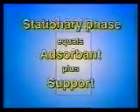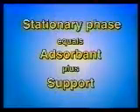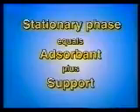In this type of partitioning chromatography, a thin layer of adsorbent is coated onto a backing support called a plate. The TLC plate is loaded with material to be separated, and then it is developed by allowing solvent to pass through the layer of adsorbent on the plate by capillary action. The two most commonly used adsorbents are alumina and silica gel.